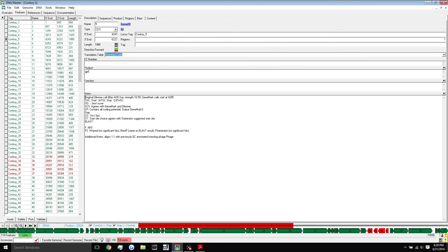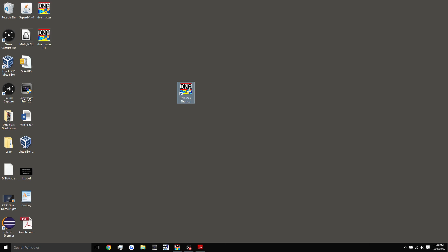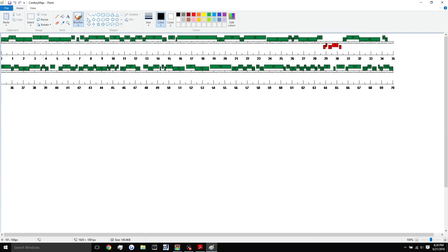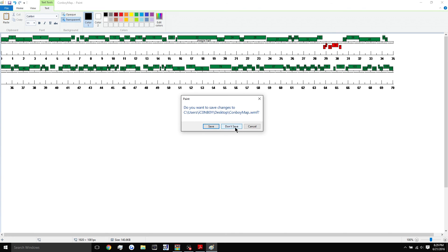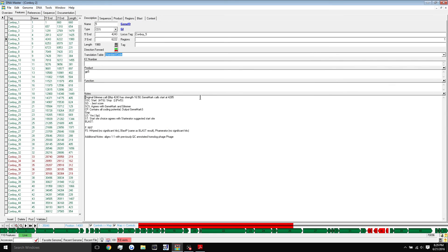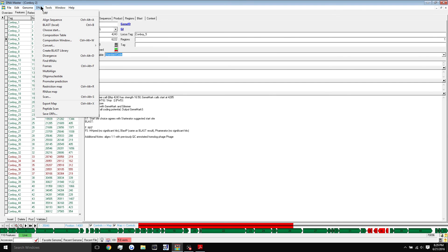I'll show you guys exactly what that did. So DNA master has this cool built in feature that opens up or creates a map of your genome just like this. It's just useful to have or useful to know how to do. The last thing I wanted to show you guys is the six frame translation. So likewise, go up into genome and scroll down here to six frame translation.